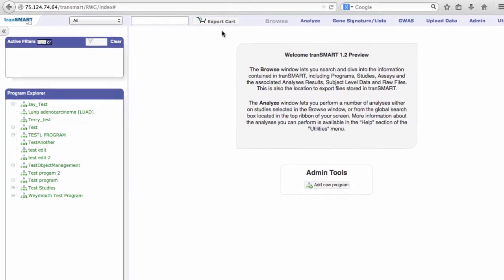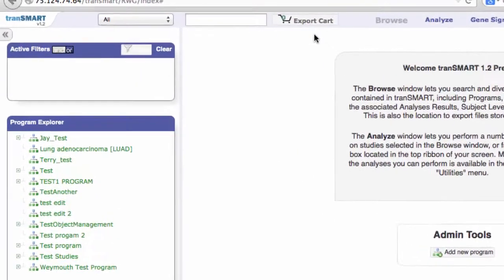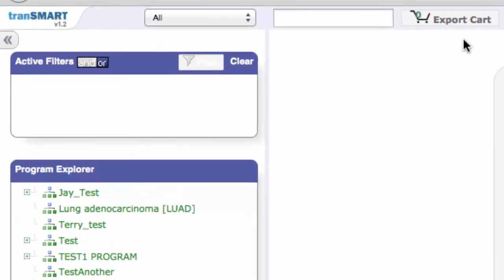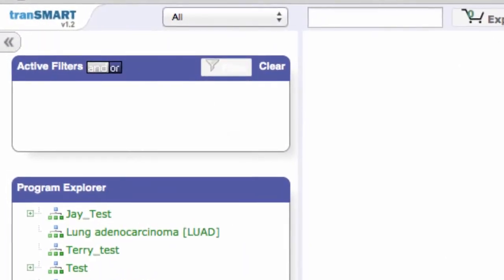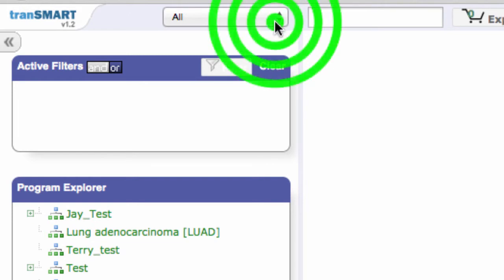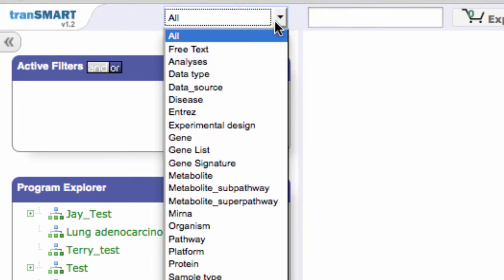The Browse tool is much more powerful than Search in version 1.1. From the drop-down next to the Browse bar, you can select which category you wish to browse.